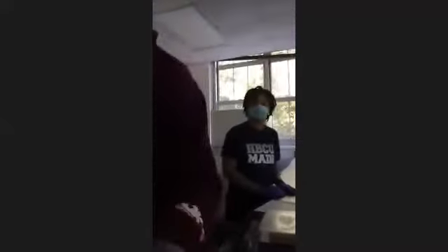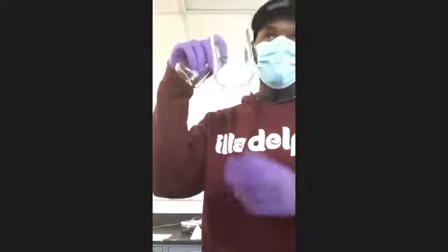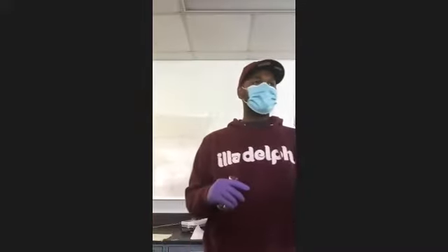So everybody has a 400 ml beaker. I want you to take that beaker and put about 100 milliliters of tap water into it. All right, so let me turn the camera back around. So we got a 400 ml beaker and we're gonna put tap water. We're gonna use this to make what we call a water bath. All right, so that's how we're gonna heat this up.